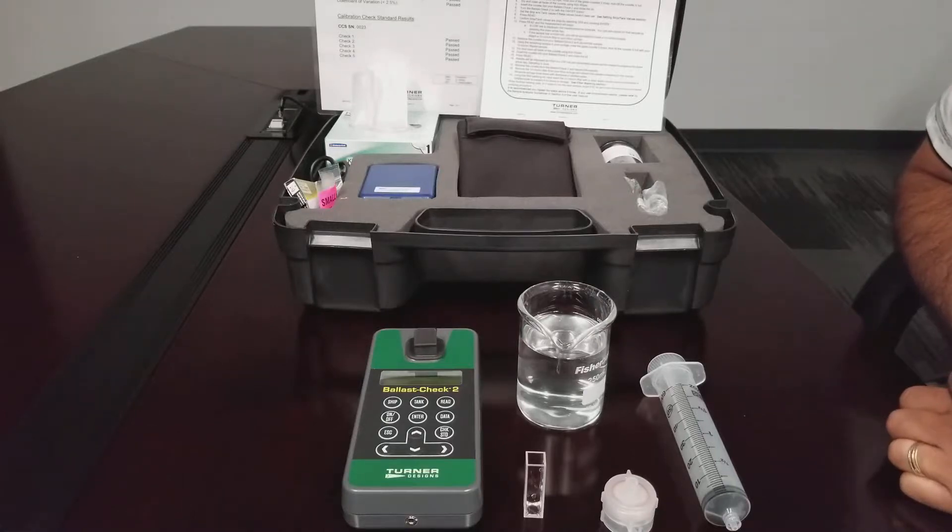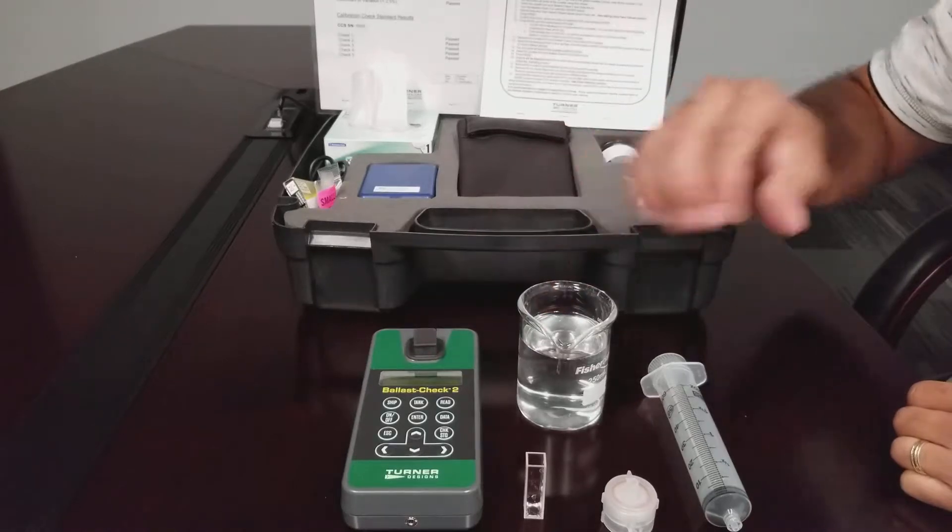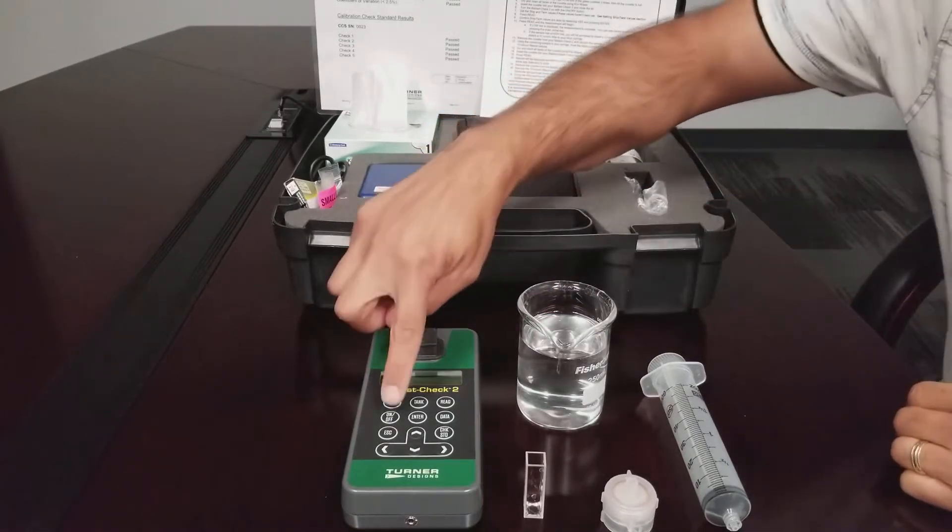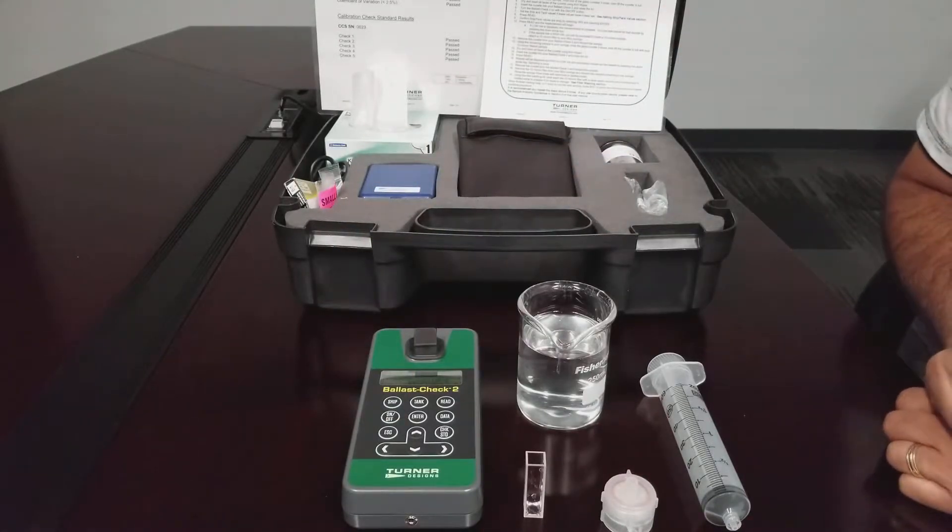This procedure will describe how to measure a sample using the Ballast Check 2. These are the items required to measure a sample. Begin by pressing the on-off button and wait for the 5 second countdown.